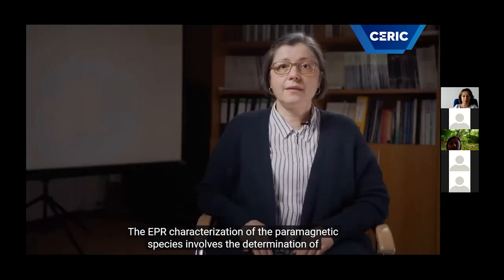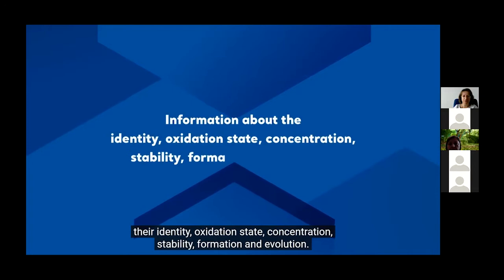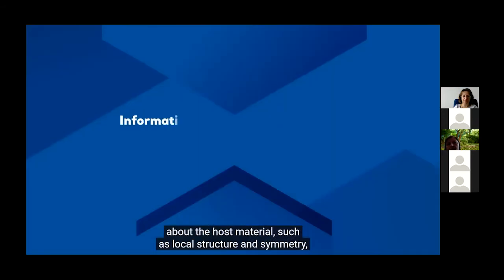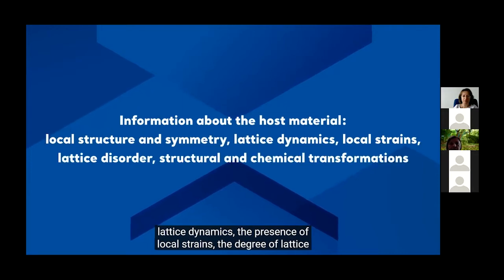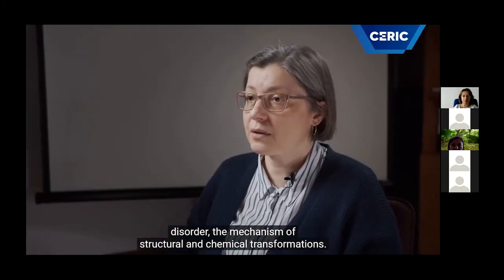The EPR characterization of the paramagnetic species involves the determination of their identity, oxidation state, concentration, stability, formation, and evolution. Some species are also used as paramagnetic probes to obtain information about the host material, such as local structure and symmetry, lattice dynamics, the presence of local strains, the degree of lattice disorder, the mechanism of structural and chemical transformations.